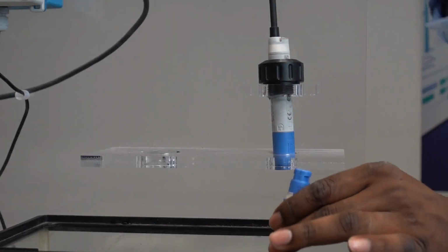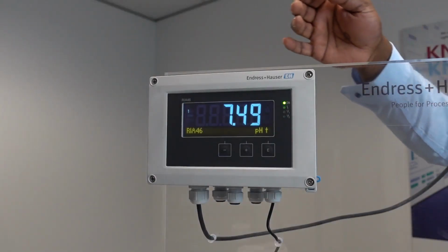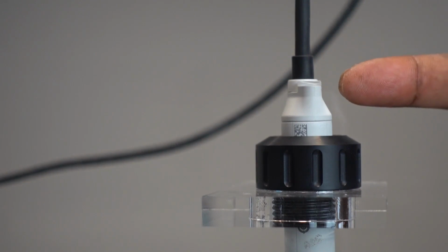And now we'll reconnect it to show you what happens. Here you will see a stable reading on the RIA46 as it's no longer in alarm. And on the CM82 you'll also see a steady flashing green light.